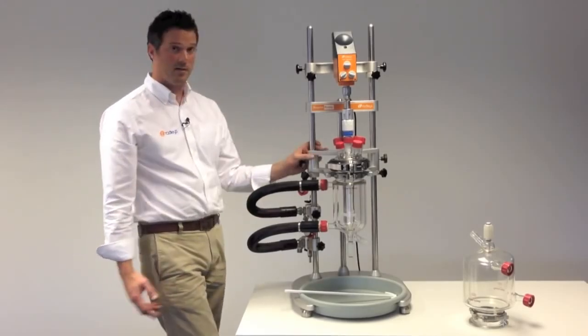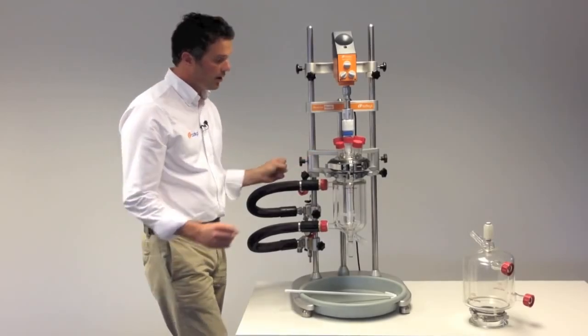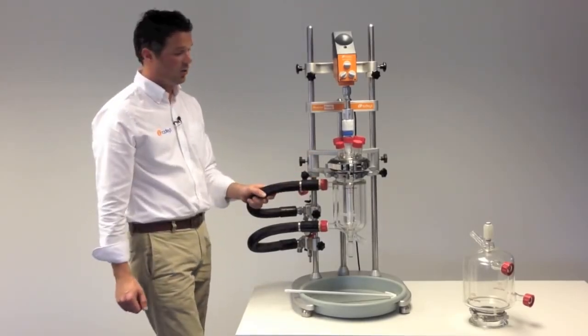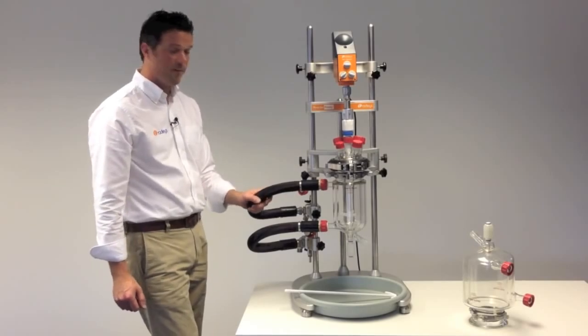So that's the Reactor Ready. A single framework that allows you to quickly exchange vessels without tools or mess, so that you don't need to have multiple setups.